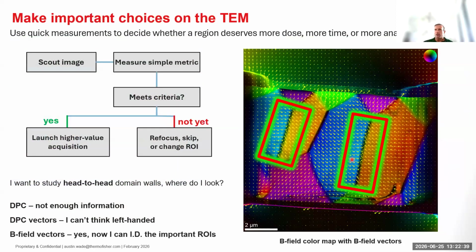This is where scripting becomes important, especially in the case of decision making. Instead of going around and collecting a high quality data set, we can script the whole process. In this case the script would evaluate simple metrics, for example the magnetic field orientation. This is the important information that we want to extract.